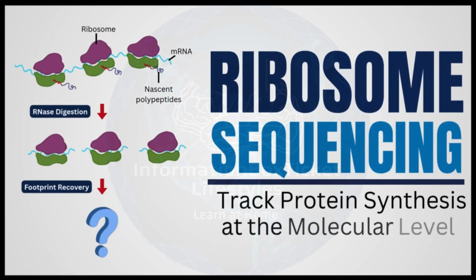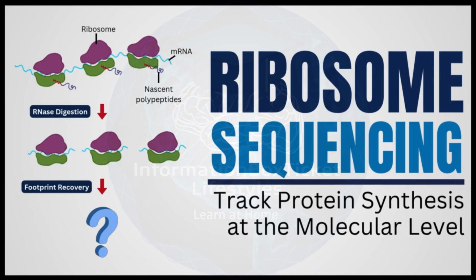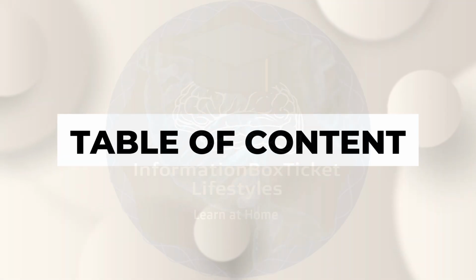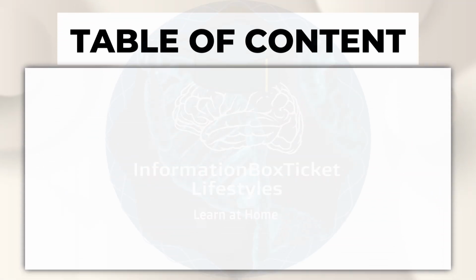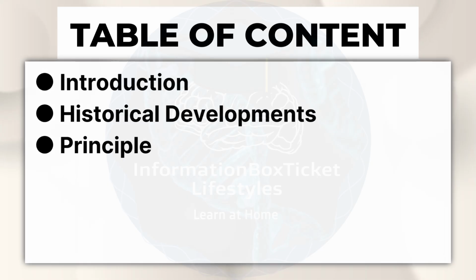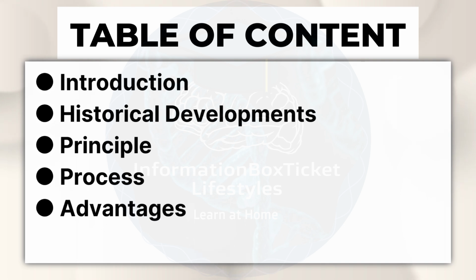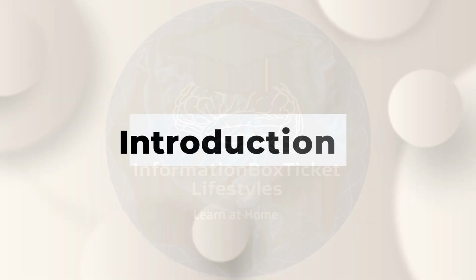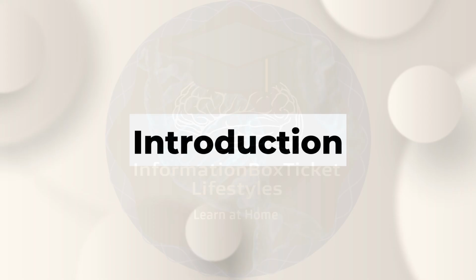Ribosome sequencing explained. Track protein synthesis at the molecular level. Table of contents. Introduction. Historical. Principle. Process. Advantages. Limitations. Applications. Introduction to ribosome sequencing.